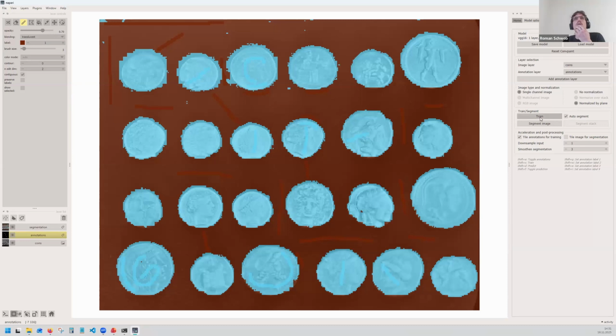So as you can see, the result already looks pretty nice. So maybe what we could still do is make sure that the border here doesn't grasp. But let's not be perfectionists here. I think we can see that with pretty straightforward work, we can solve this admittedly pretty simple segmentation task.